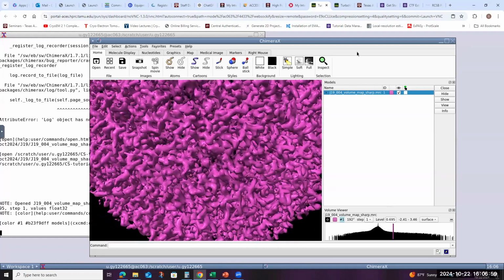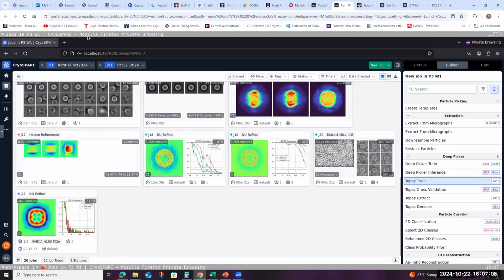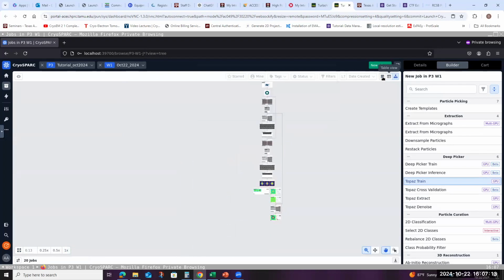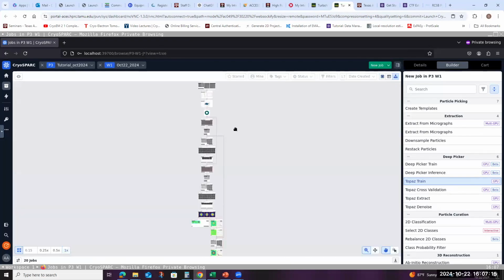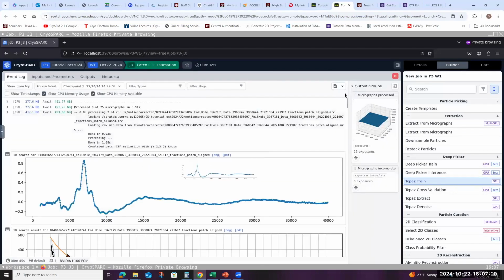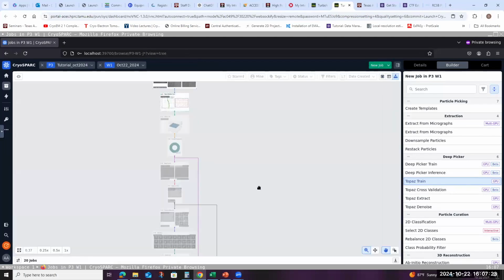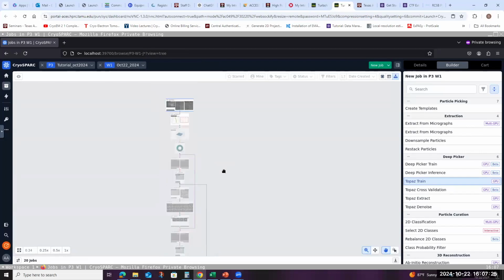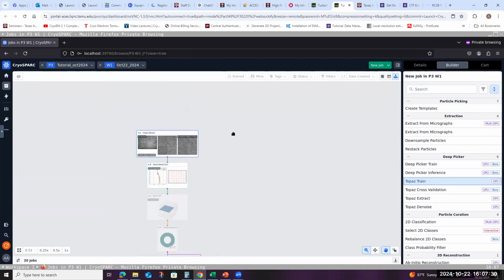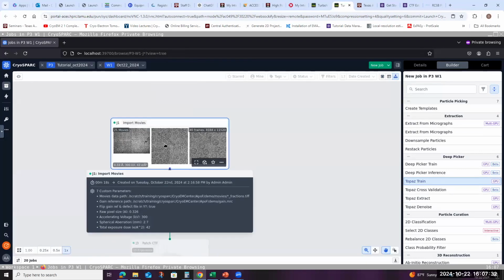Gaya, do you know if there's a way to export a history of your project? So if someone wanted to repeat the same steps. All the projects have the hierarchy here. It's a workflow. Is there something with details on the parameters that were selected, the values that were selected? Or is that just for yourself, if you wanted to share it?